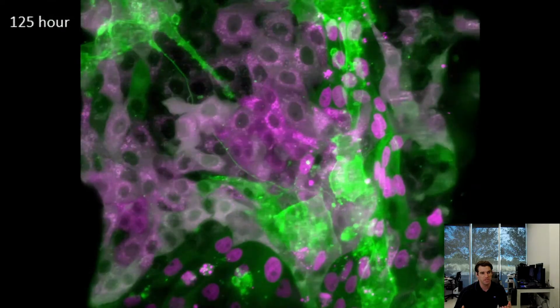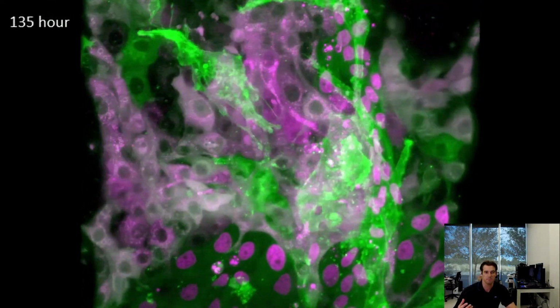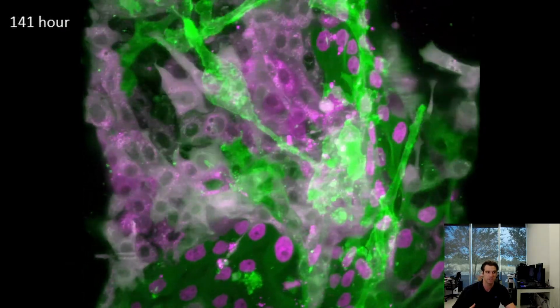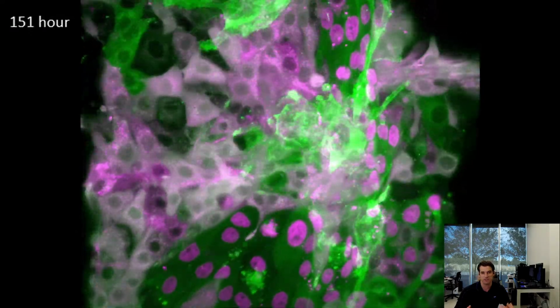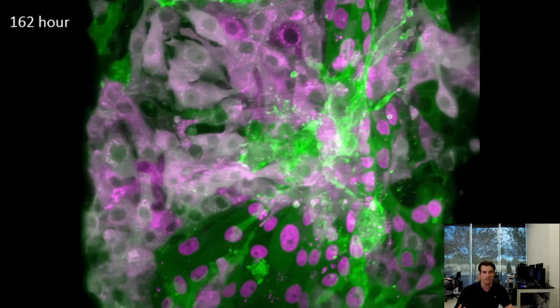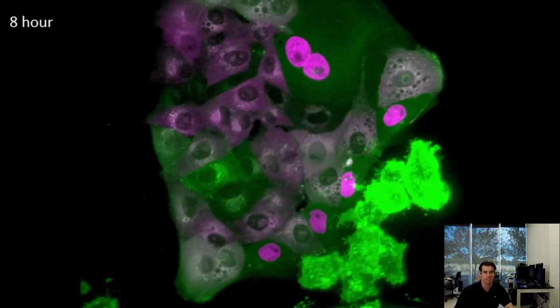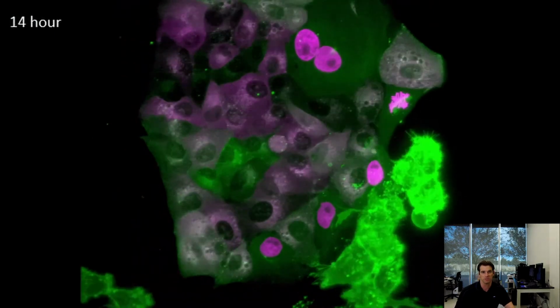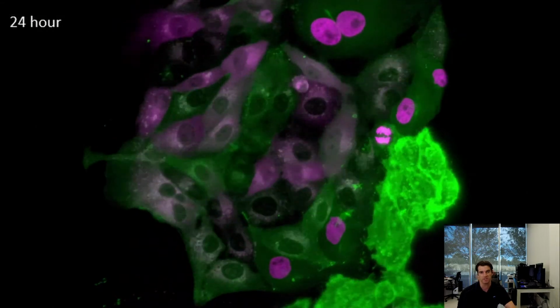And this was an experiment that we did where we didn't actually even have any question that we were trying to answer, but because we were able to take a video, it was imaging every 5 minutes for an entire week. And this is a 3D, every time you image, you're getting 3D data with the lattice light sheet. Then we were able to just learn so much about each individual cell. And if you watch each individual cell type, you learn a whole lot about those as well. They have their own personality, for lack of a better term.